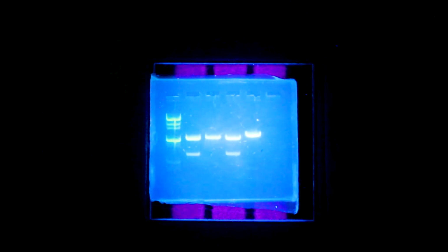Here we go. So what you should notice is you have the 5 different lanes, and lane 1 was our DNA standard marker. And for my purposes in this lab, I was really running that as a control just to make sure everything was actually working. You can use the standard markers for some more precise calculations in other labs, but for our purposes, we're just confirming that everything was working, and we can see there, we see lots of bands, so yes, things were working.